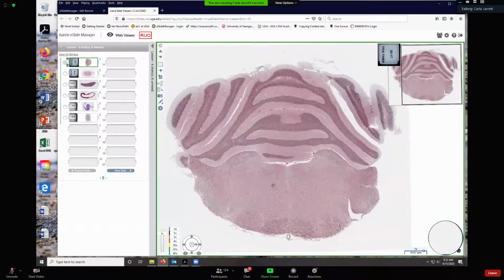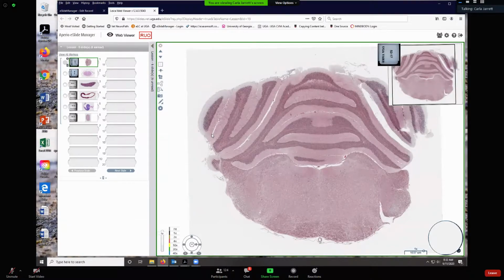The cerebellum has folds and sulci. Its folds are called folia. I don't know if you've ever heard the cerebellum referenced as the arbor vitae or the tree of life. So the tree would have foliage. So folium. This is one folium, plural would be folia.